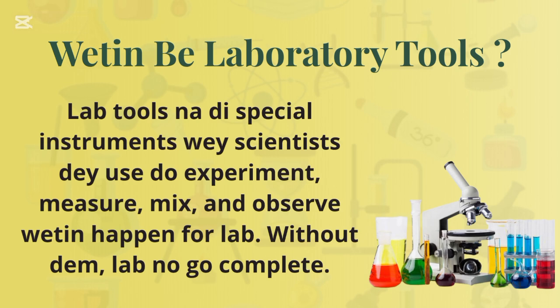As we talk say lab na our kitchen and e be like our workshop, make you no think say na fork and knife or na screwdriver and hammer we dey use for lab o. No be so. E get some special instruments and equipment wey scientists dem dey use when dem wan do their experiments for lab. Na those ones wey dem dey call laboratory tools. Dem plenty, but we go look some of them for this our talk. Make we dey take them one by one.